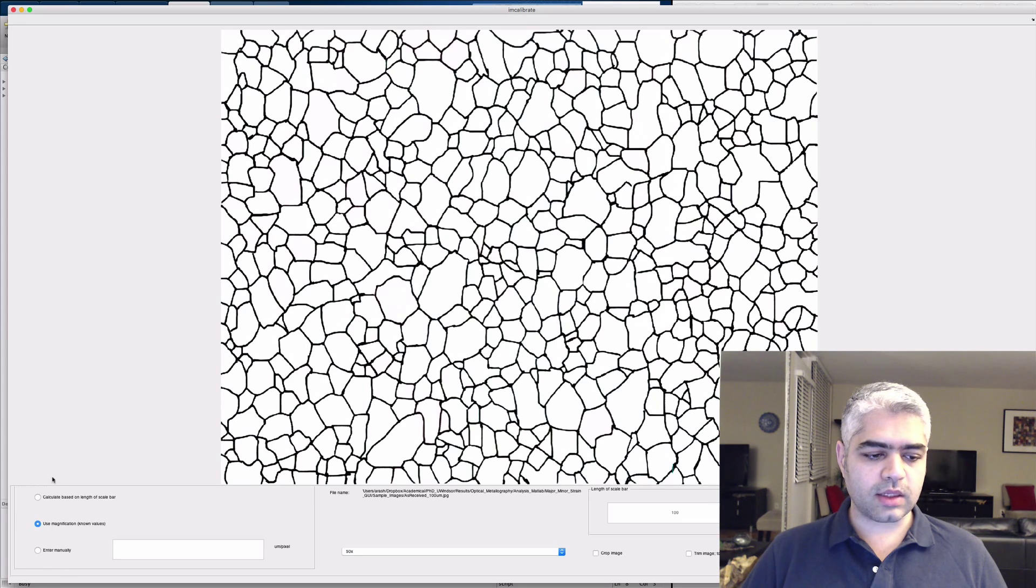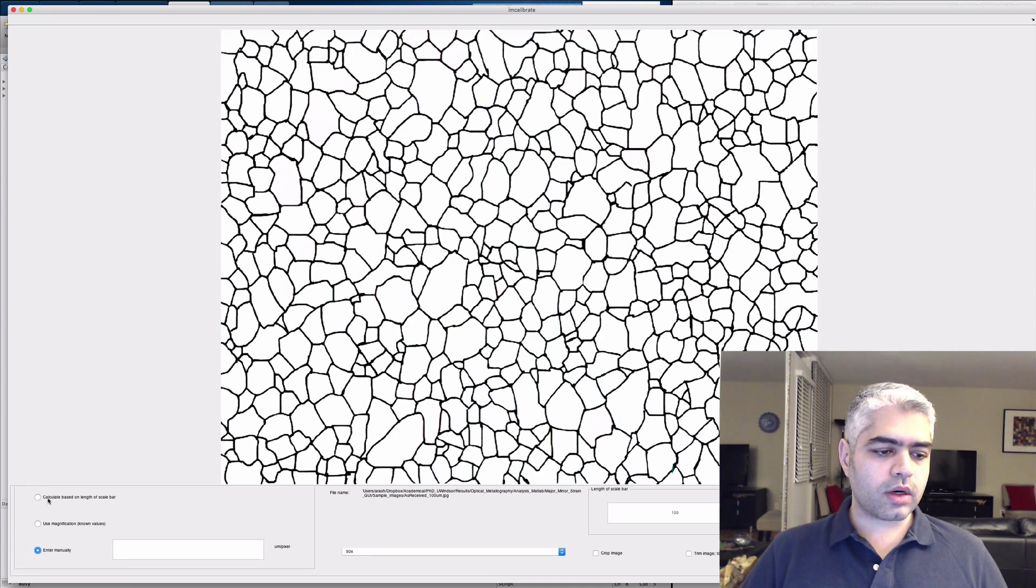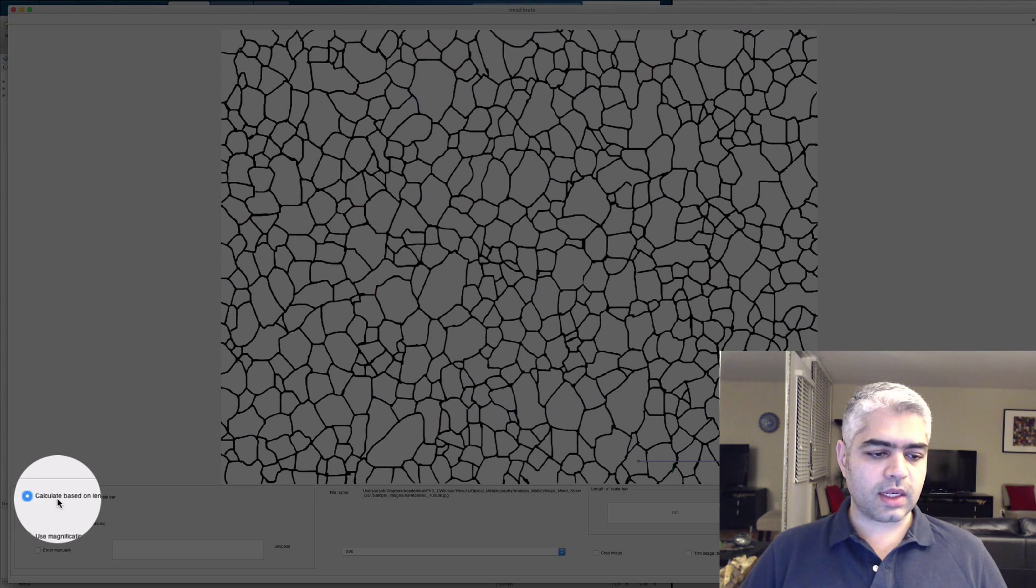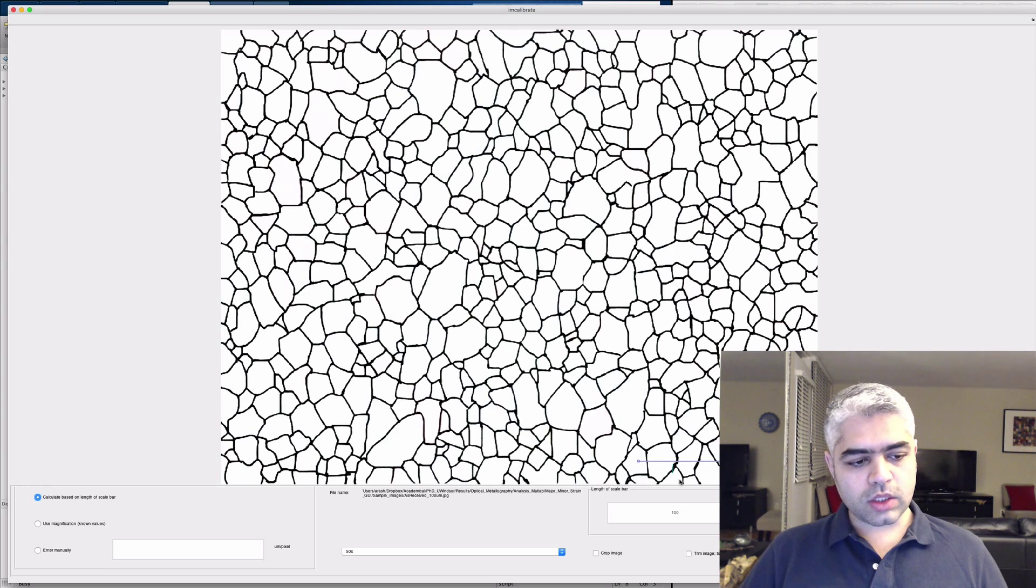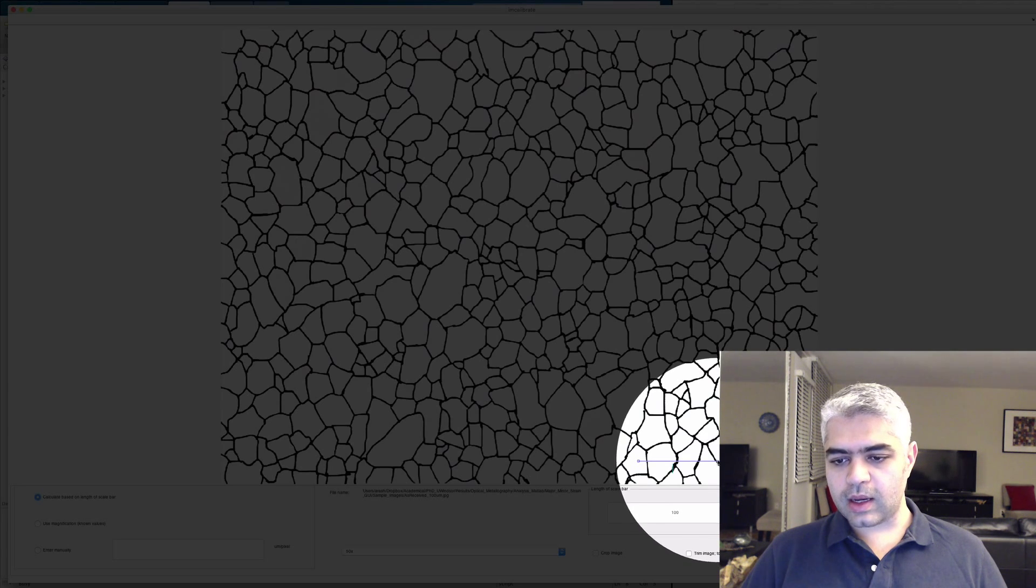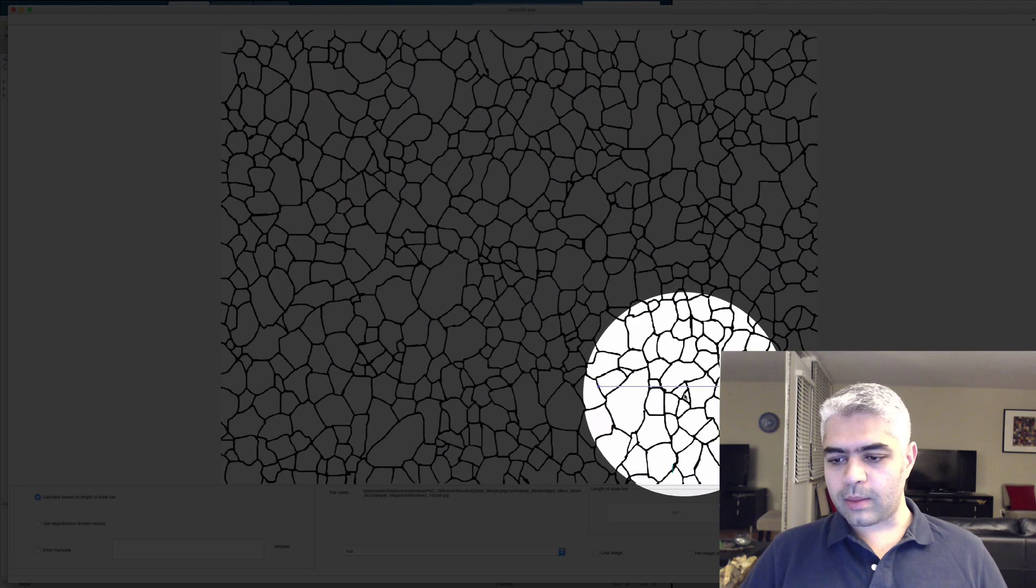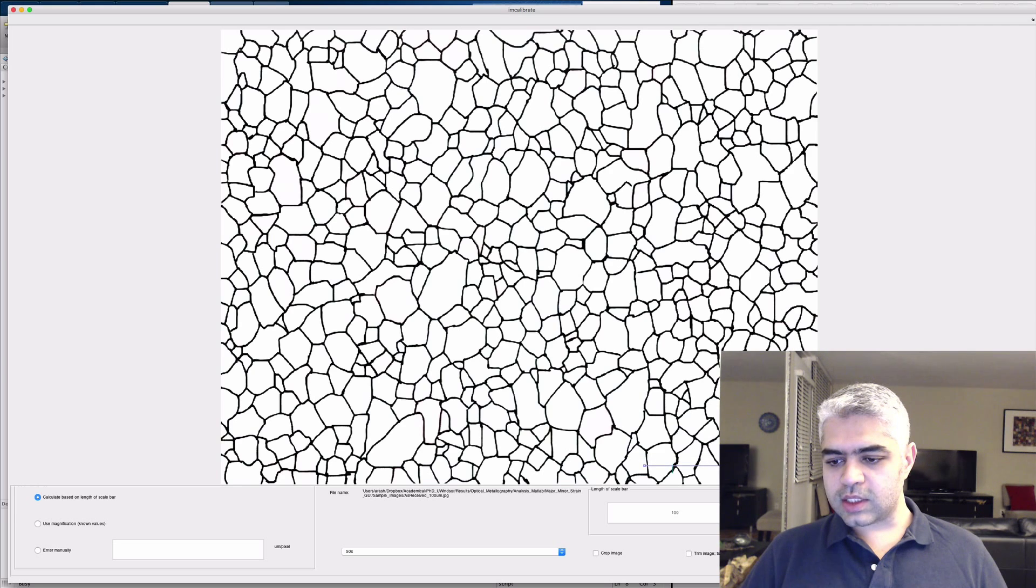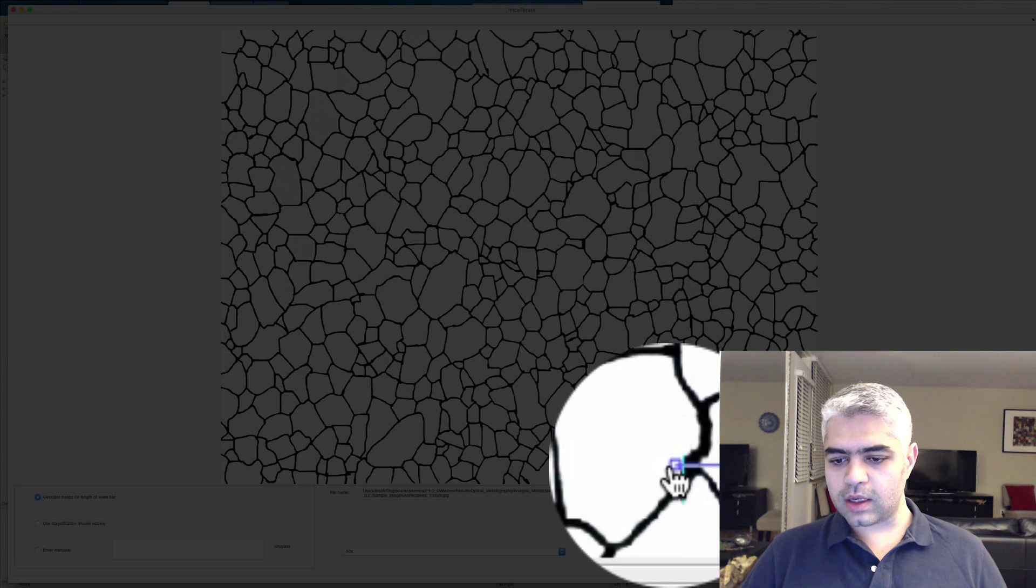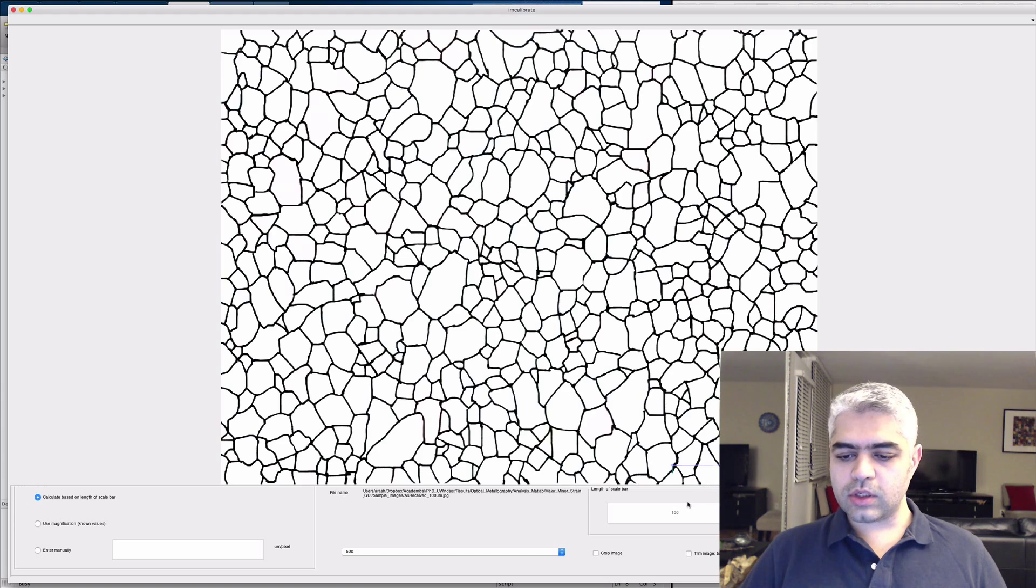Either manually micrometers per pixel, or using the calculated based on the length of the scale bar. Once you click on this, you're going to have this blue bar appear. You need to adjust it, place it at one side of the scale bar, and resize the other part.